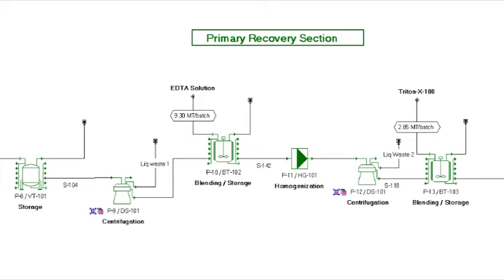Operation Unit 11: Homogenizer HG101. Next, a high pressure homogenizer is used to break the cells and release inclusion bodies. The broth undergoes three passes under a pressure drop of 800 bar and an exit temperature around 10 degrees centigrade.